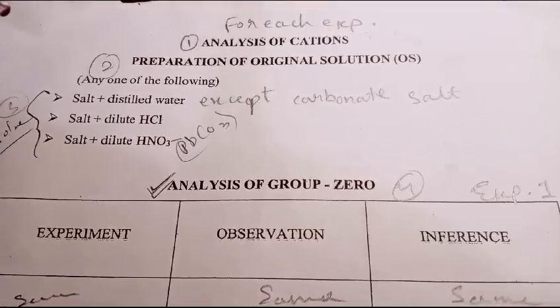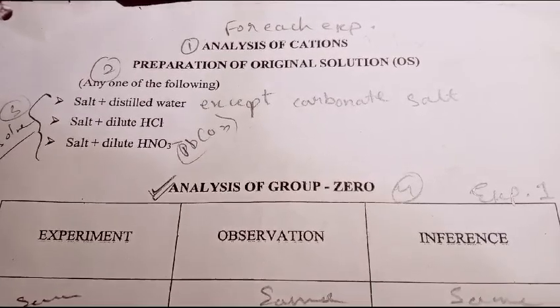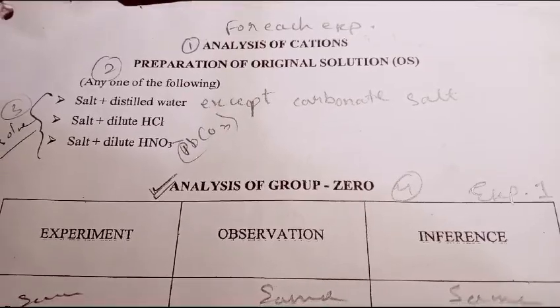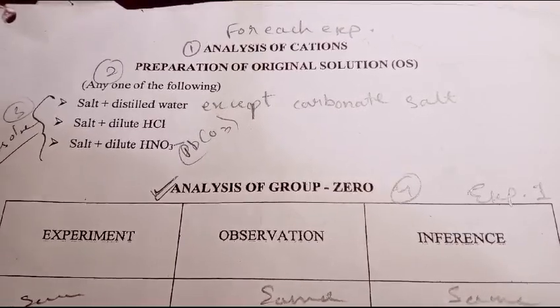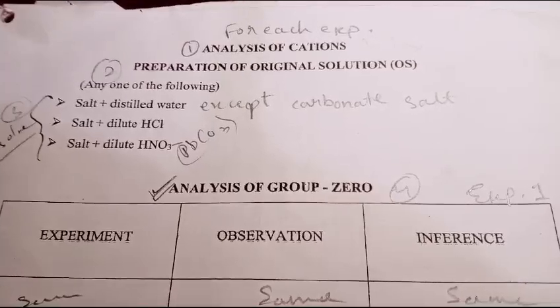Add dilute HCl, it dissolves. If not, then take another 1 or 2 spatulas of salt and dilute HNO3. In these 3 options, any one you will get. The original solution will be prepared by the dissolving of the salt.